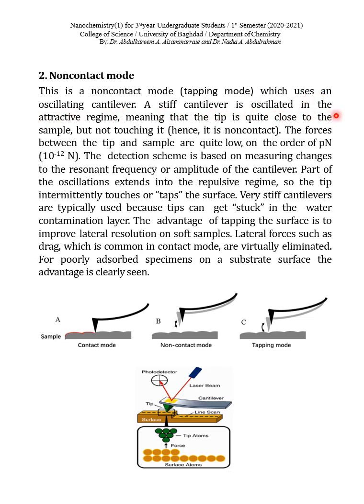A stiff cantilever is oscillated in the attractive regime, meaning that the tip is quite close to the sample but not touching it. Once again، إذن النقر وفي حالة repulsive يا أما يكون attractive or repulsive حسب التآثرات ويا ال tip ويا السيرفس.